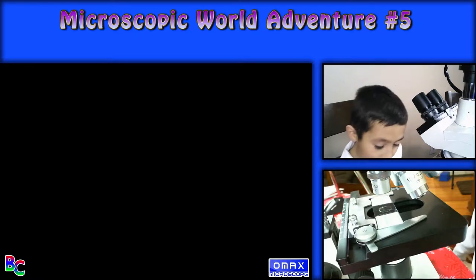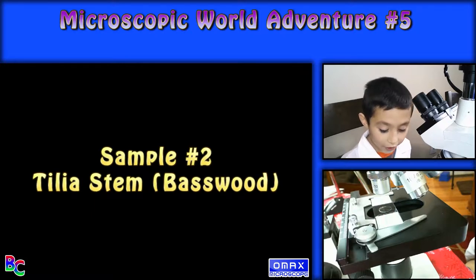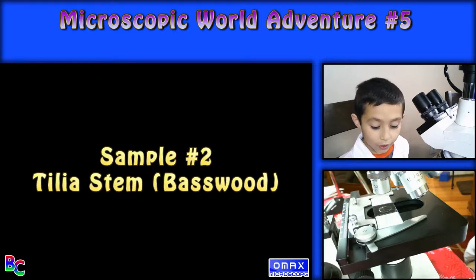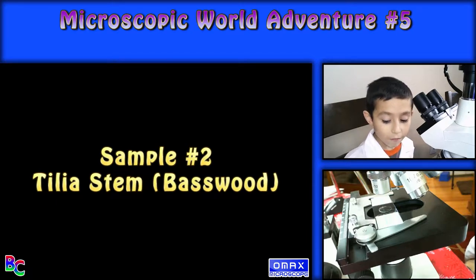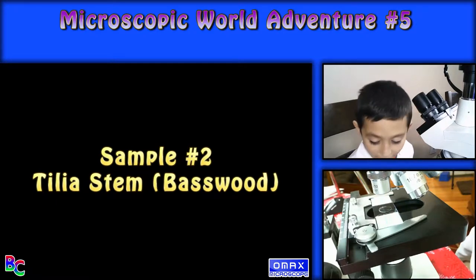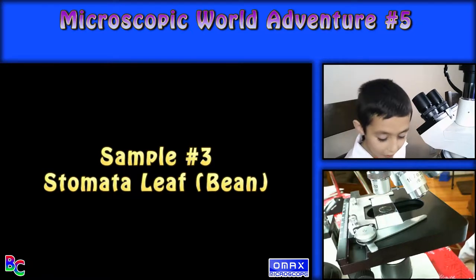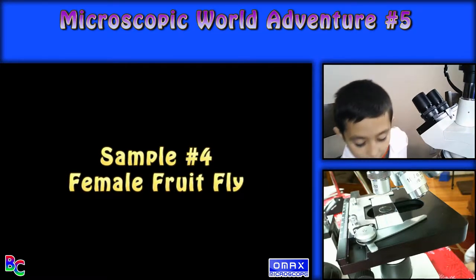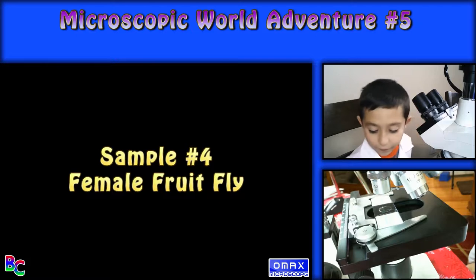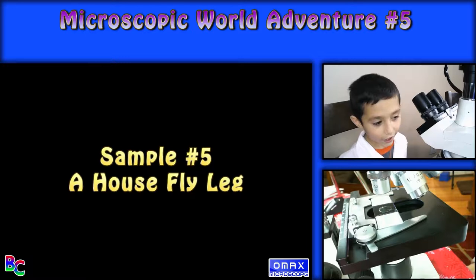Number one is young roots of broad bean. Number two is Tilia stem — Tilia is a kind of American basswood. Number three is stomata leaf type, which is a type of bean. Number four is fruit fly female. And number five, a housefly leg.